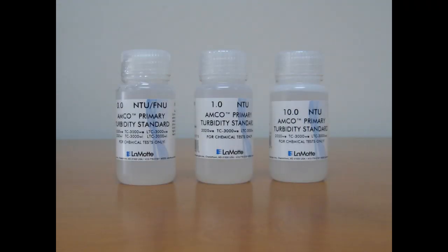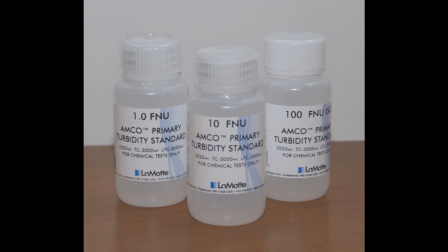The standards come in either NTU or FNU units. The NTU standards are for use with the 2020 WE EPA version. The FNU standards are for use with the 2020 WI ISO version.